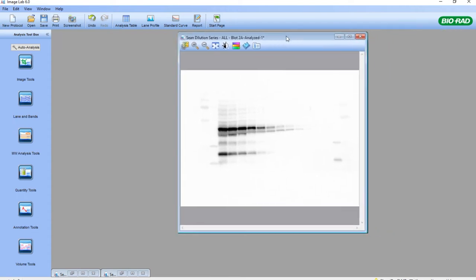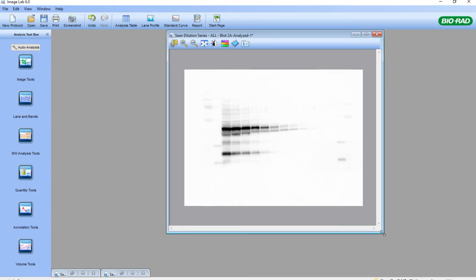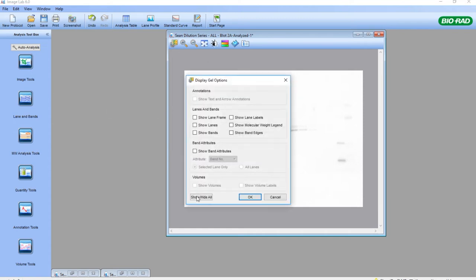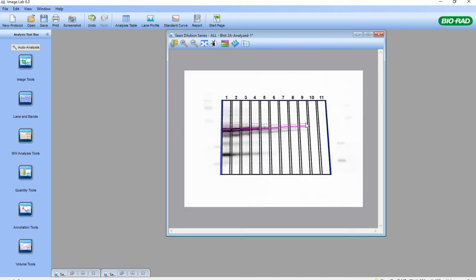Now I'm going to look at the chemiluminescent blot. By the way, never do any type of quantitation on a merged image, as we've done with the molecular weight analysis. Quantitation should always be done on the original chemiluminescent or fluorescent western blot image generated by the imaging system. We've already performed the lanes and bands on this image, as we see here.